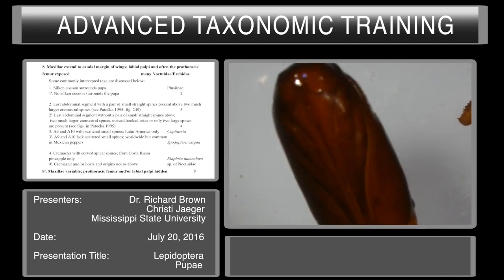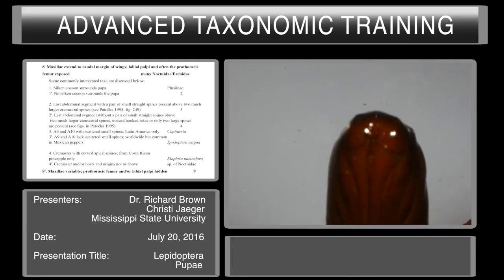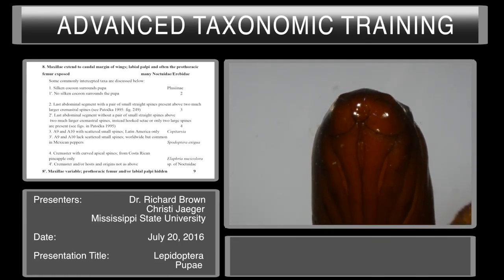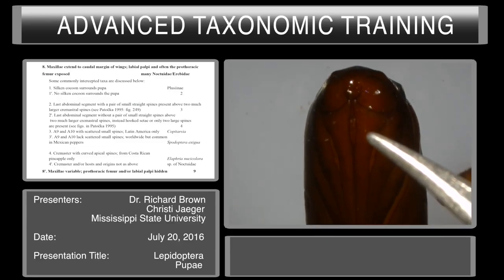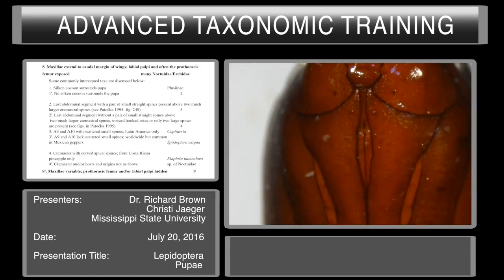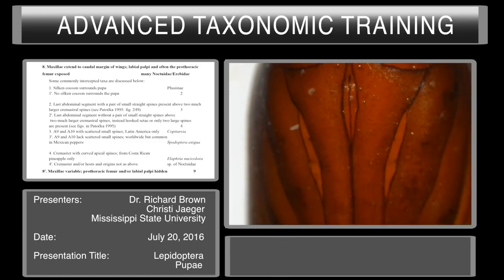For couplet eight we'll be looking at the maxillae, going back to the area near the face where we were looking for the pilifers. Maxillae extend to the caudal margin of the wings, with labial palpi and often the prothoracic femur exposed. The maxillae start up here and extend down the length to the bottom, which describes the first part of this couplet — maxillae extending to the caudal margin of the wings. We can also look for the labial palpi to ensure they are exposed, and if we zoom in we can see that they are. The lighter shaded region between the maxillae and the mesothoracic legs is the prothoracic femur.